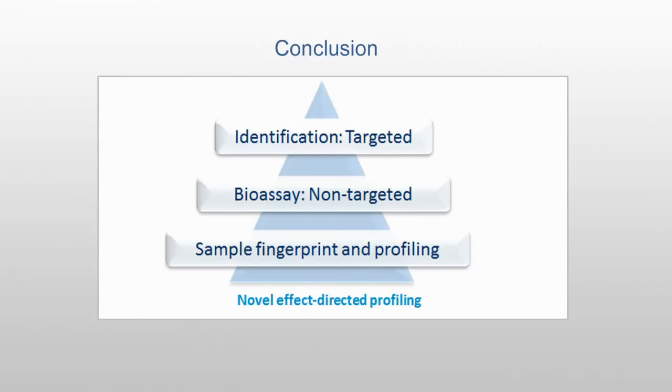The use of HPTLC offers greatly simplified separation. It's certainly no match for HPLC or GC in terms of resolution and separation number, but it can separate a complex mixture with little to no sample preparation. In HPTLC, the samples remain as native as possible for profiling.